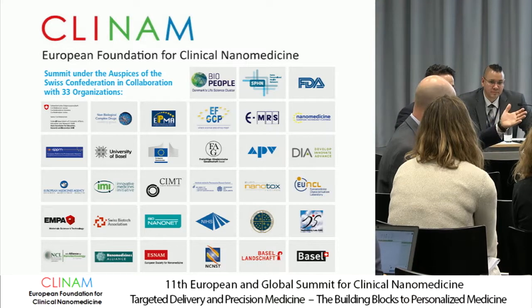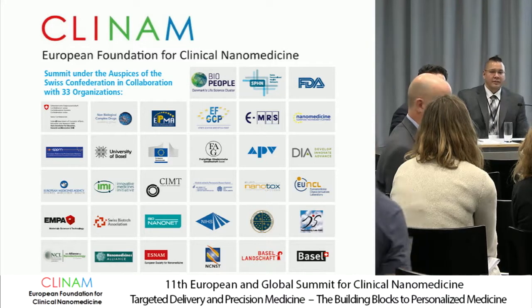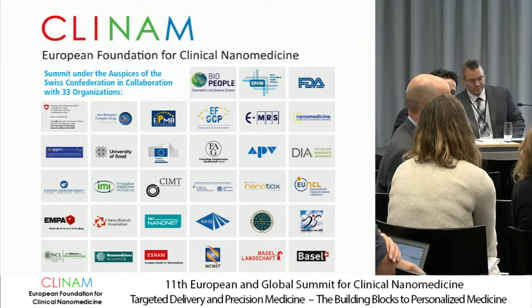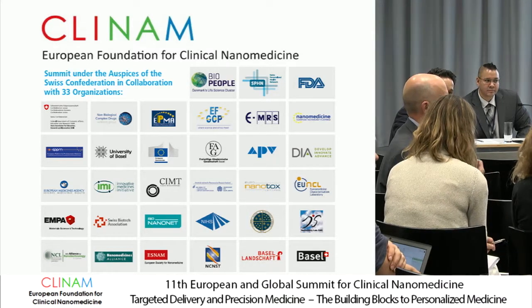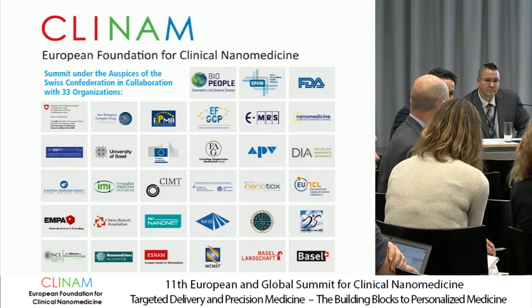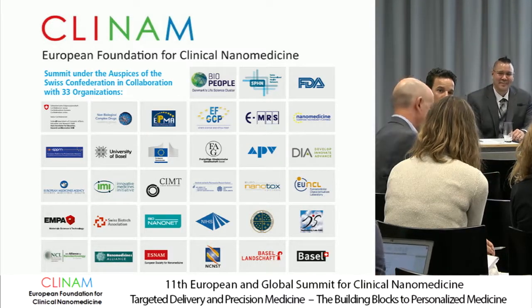Everybody has a DLS in the world, almost. And this is why Malvern is so rich. How do you get past that problem? It's like a circular argument. Everybody has it, so let's keep doing it, as opposed to the FDA saying, I think they've actually got to grips with it. They're now going to specify a minimum level of resolution for size, which clearly DLS will never meet.